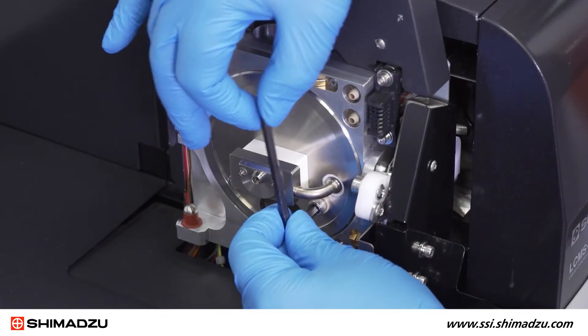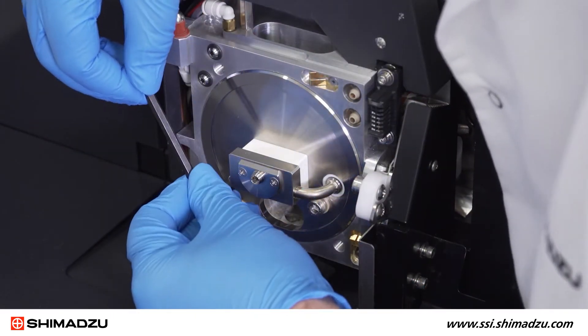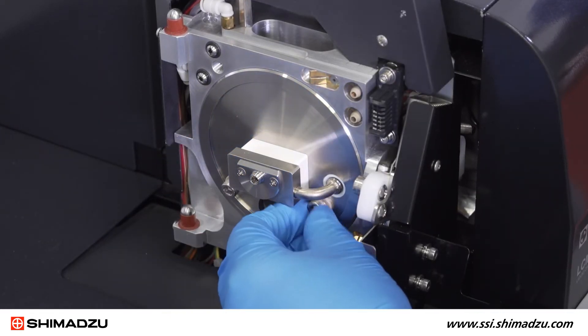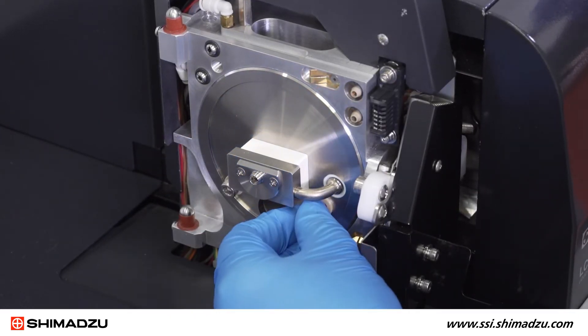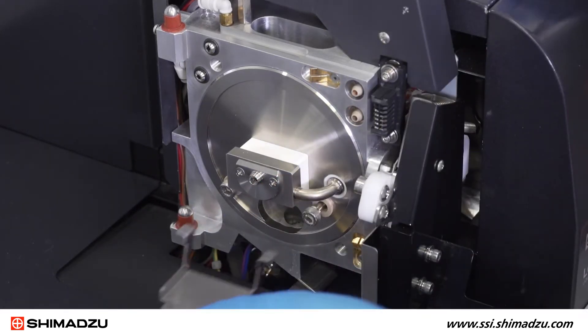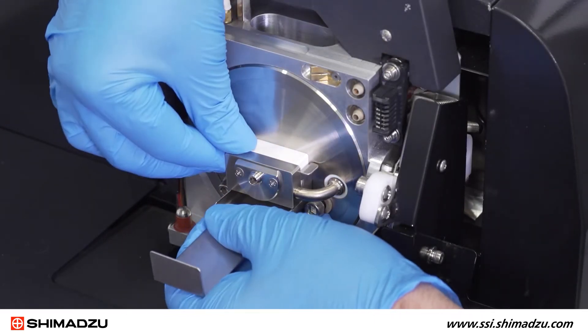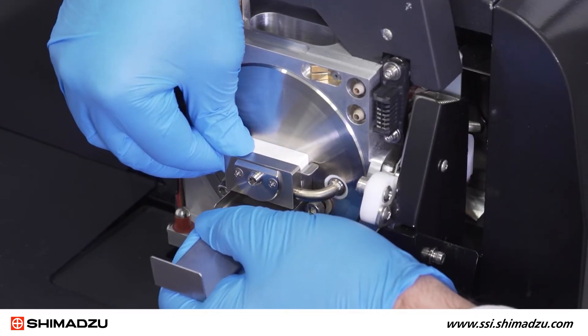Using the hex wrench, loosen both bolts on the front of the heater flange. The bolts have a capture mechanism so you cannot completely remove them from the flange. Using the drawing tool, remove the heater flange by inserting the drawing tool behind the heat block and pulling the heater flange straight out.